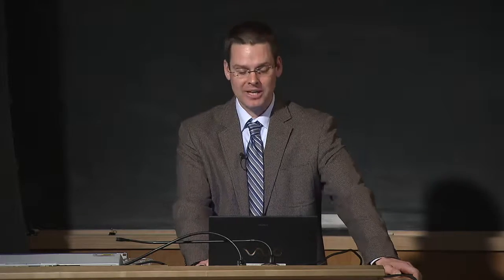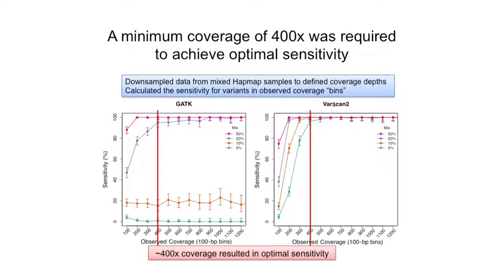Yeah, and also this was one data set that was downsampled. So all the variants that are detected at the 10% level are probably the same variants. So maybe it's an artifact of the mixing that we did.